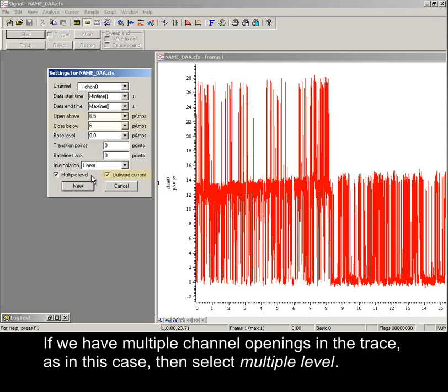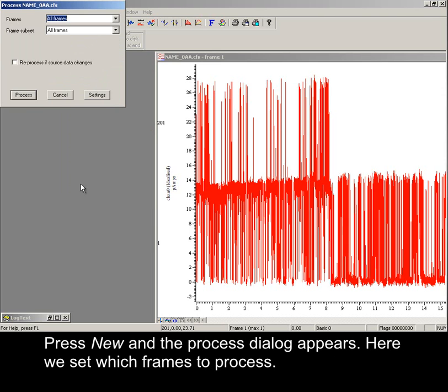If we have multiple channel openings in the trace, as in this case, then select multiple level. Press New, and the process dialog appears. Here we set which frames to process.